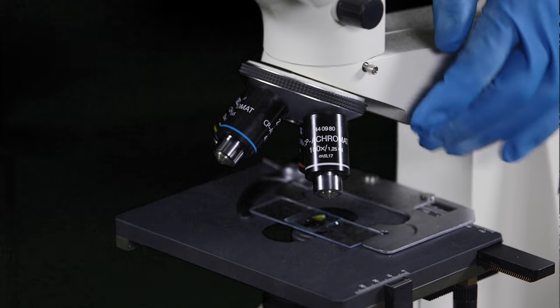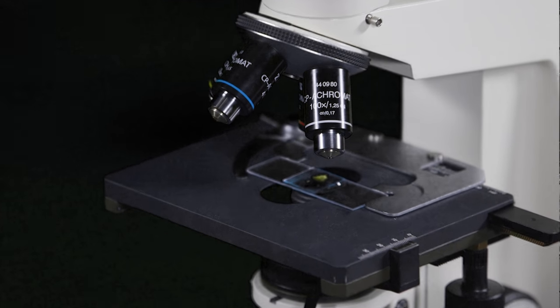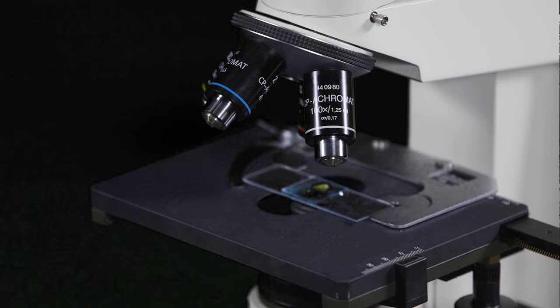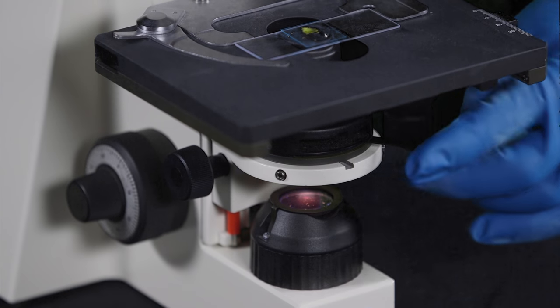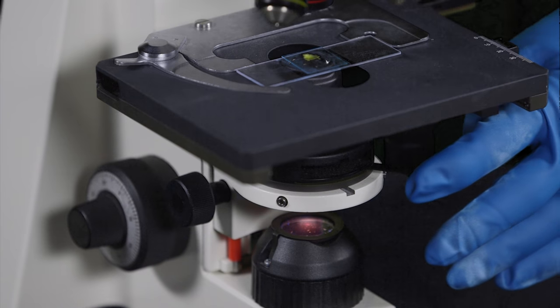Rotate the turret until the lowest power objective is above the specimen. It will click into place. Pull the iris diaphragm lever all the way closed and then slightly open it.